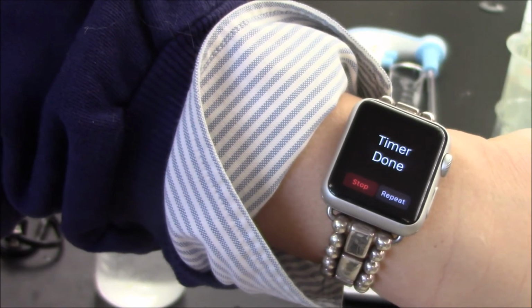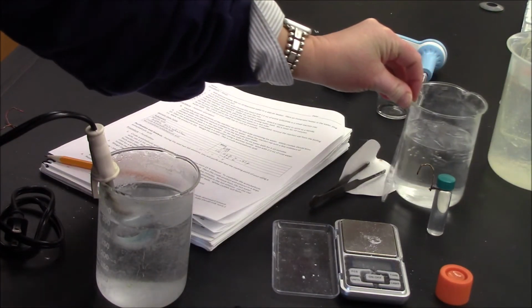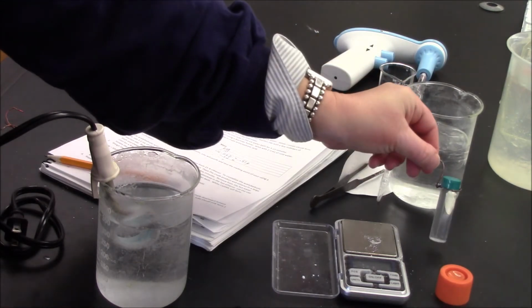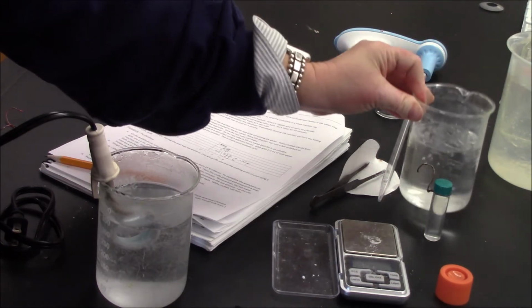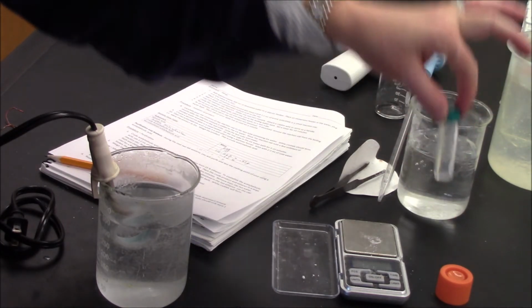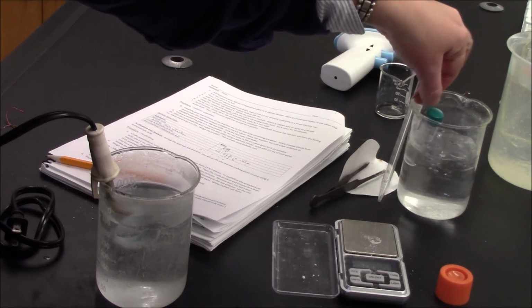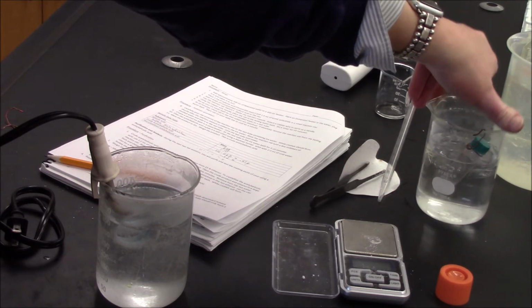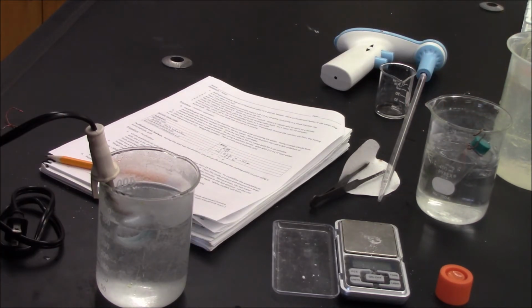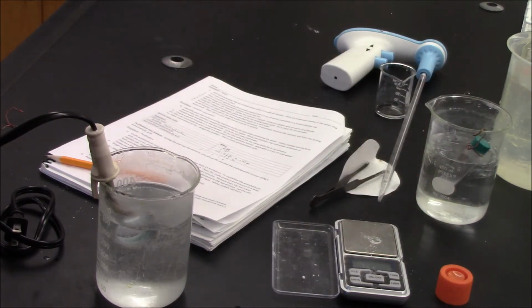I'm back as my timer is going off. Now it's time to transfer my vial to my ice water bath. I'll tighten the cap one last time, and I'll add it to my ice water bath to incubate. The procedure says to let it sit for several minutes, so I'll set my timer for 10 minutes, and I'll check back with you then.